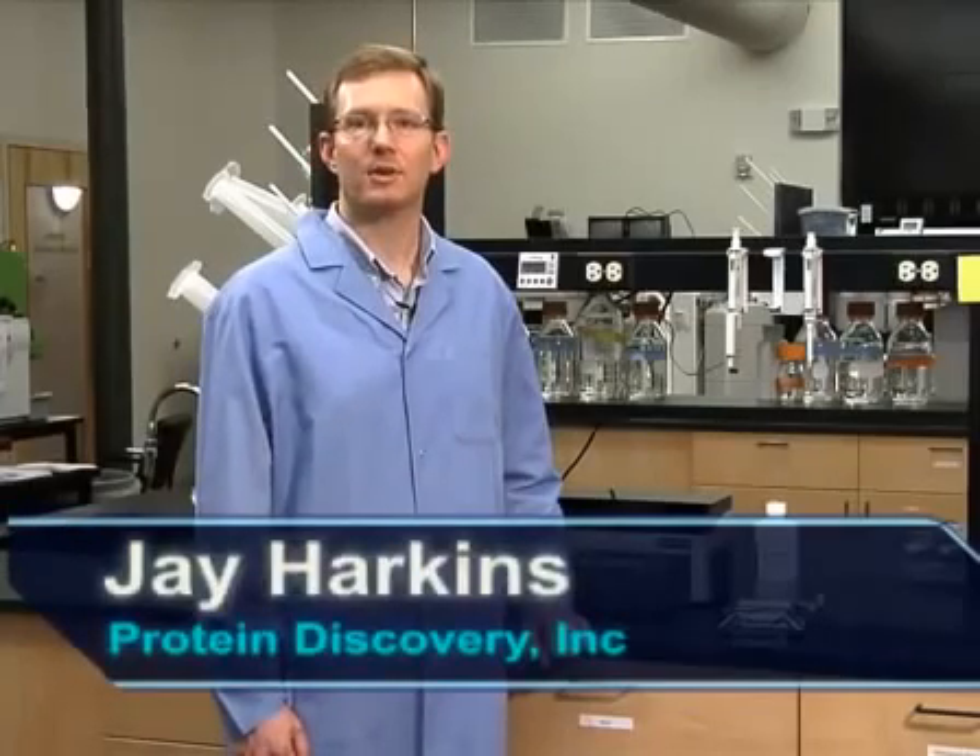Hi, my name is Jay Harkins. I'm a research scientist at Protein Discovery. Today I will demonstrate how easy it is to use the new gel-free 8100 fractionation system to achieve high-recovery molecular weight based fractionation.